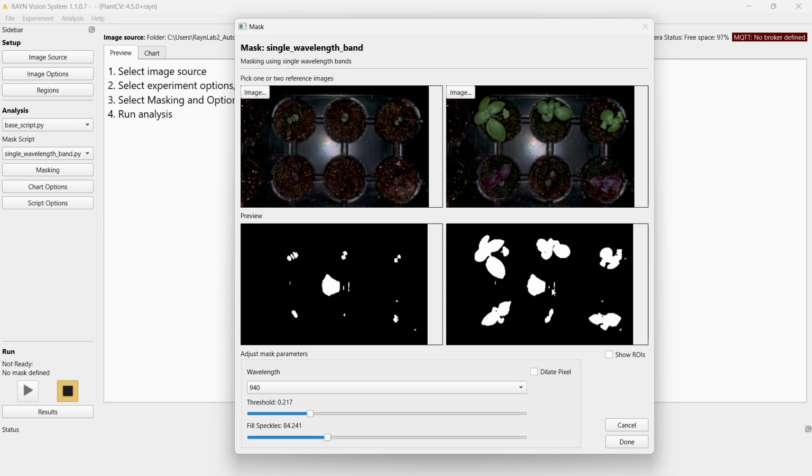In general, about masking, what you want to do is segment your image. You want to differentiate between background and the samples you want to analyze. It's not always possible to get it as clean as you would like it to be. As you can see right here, we have quite a big artifact. But what's more important is that this artifact is not covered by a ROI. That's why you can use the ROI overlay and check if there is any artifact in your ROI. And as you can see right here, there is none. So these settings should be fine for the analysis.